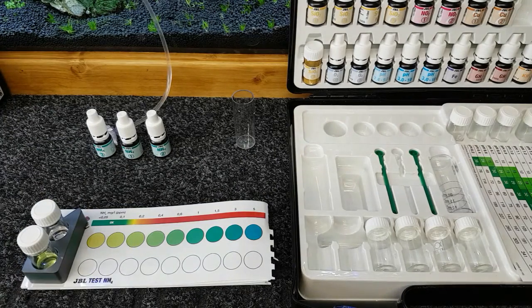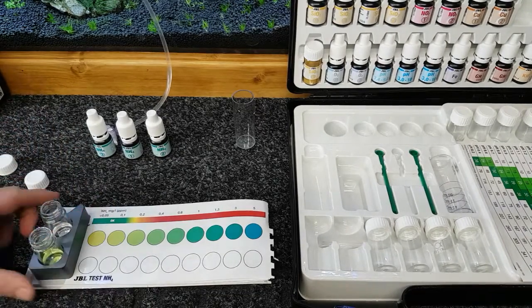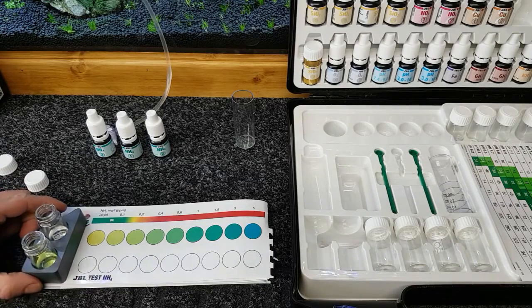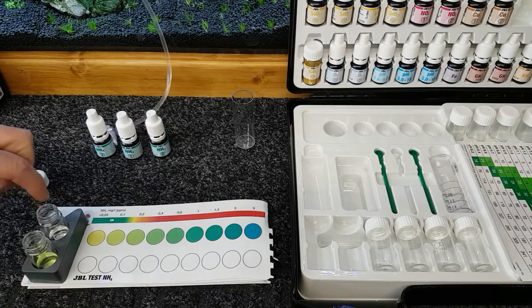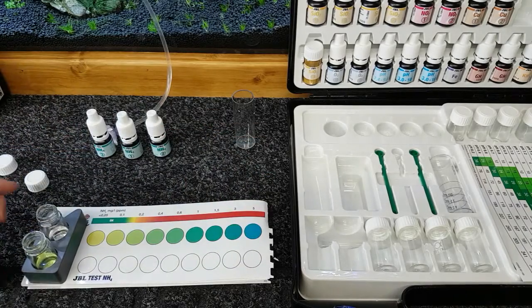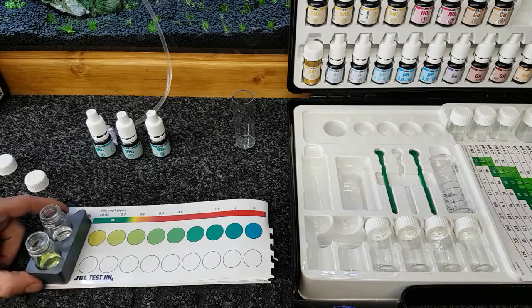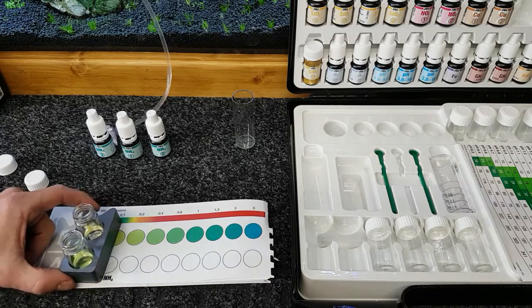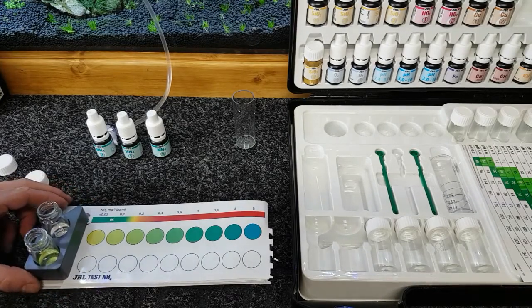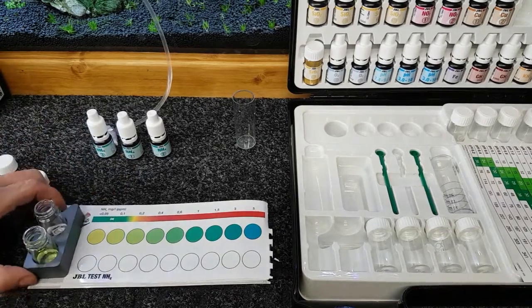Okay, we're back. It's been 15 minutes. Now we can take off the tops. Now what we do is we slide along now, and we correspond. Obviously we're looking through the clear side here to the colours which indicate how many parts per million of ammonia is in your system and in your test. So what you do now is you slide that across there onto the first one. It's going to be hard for you guys to see, but what you want to do is match up the colour in that one to the colour on that one.